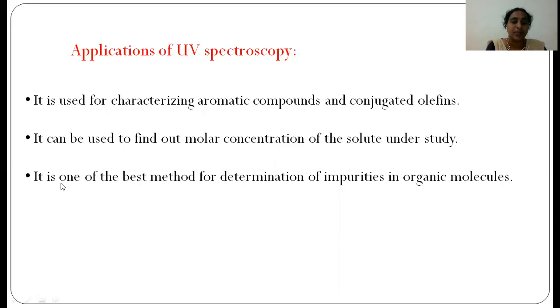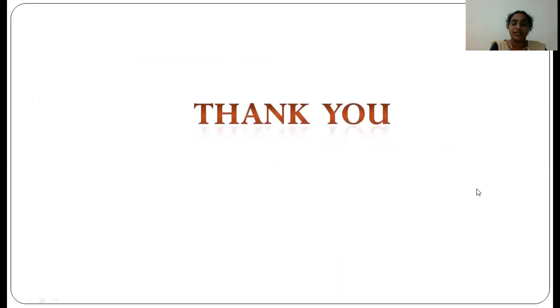Also, it is one of the best methods for determination of impurities in organic molecules. So these are a few of the applications of UV visible spectroscopy.